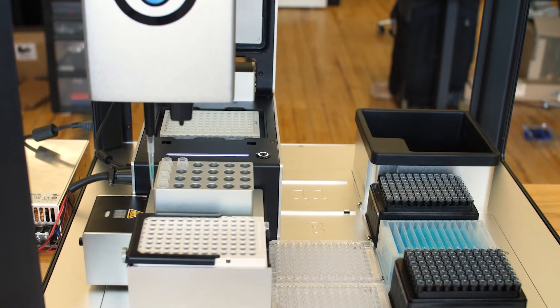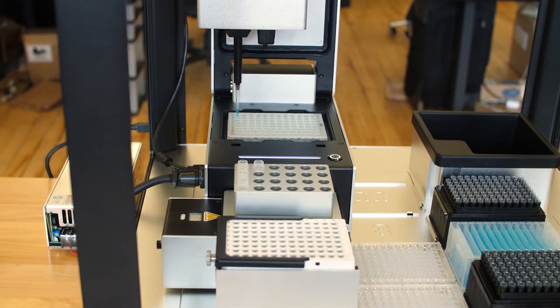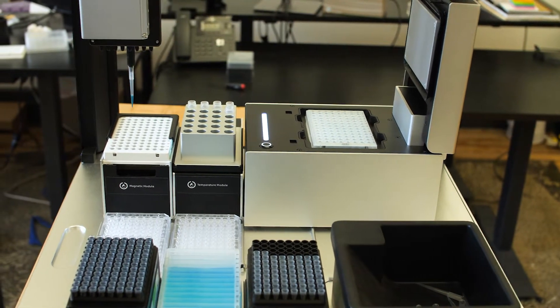Designed for common PCR based tasks like NGS library prep, our thermocycler easily compares with thermocyclers two to five times its price. To ease integration with automated protocols, the thermocycler has a fully automated lid and programmable block temperatures to ensure your reagents are held at a safe temperature while the OT2 handles the rest of the pipetting.